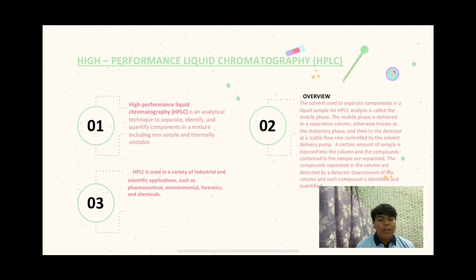So what is HPLC? HPLC, or High-Performance Liquid Chromatography, is an analytical technique to separate, identify and quantify the components in a mixture, including non-volatile and thermally unstable compounds.